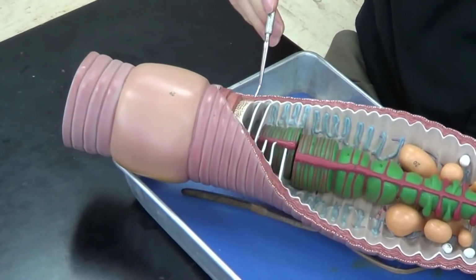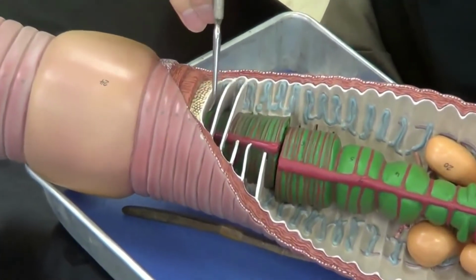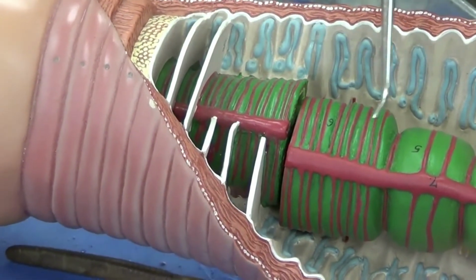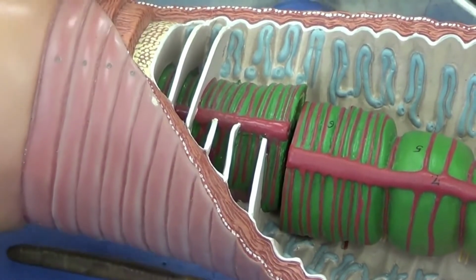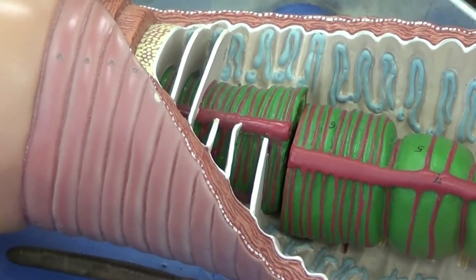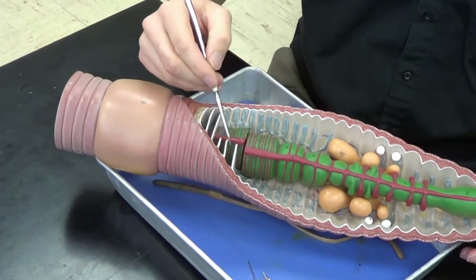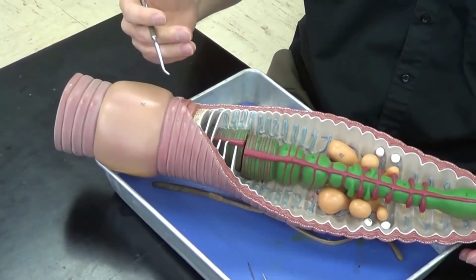Now, also noted here, you can see these large flaps of skin right here. These are called septa, and they actually separate the internal part of the worm into compartments. So they are responsible for segmentation. The earthworm is not only segmented externally, but it's segmented internally also. And in each one of these compartments are different organs.